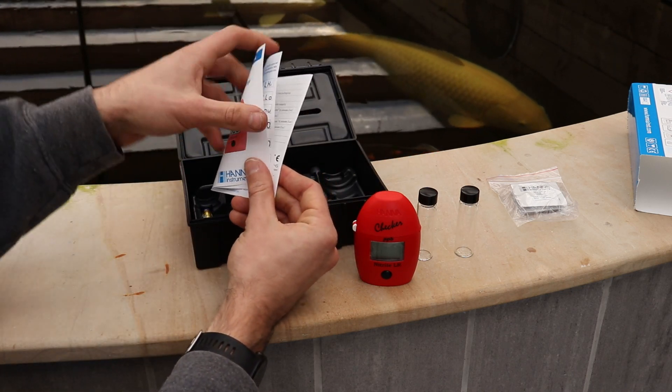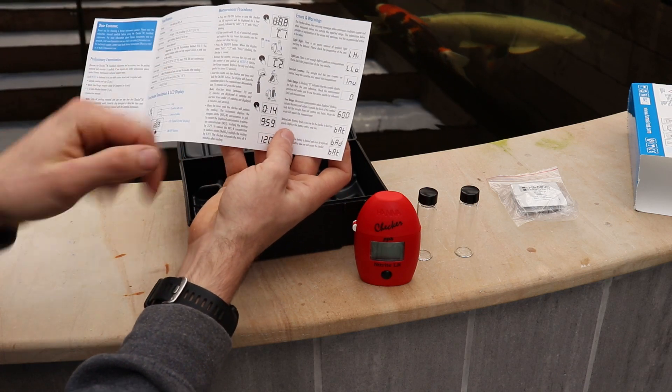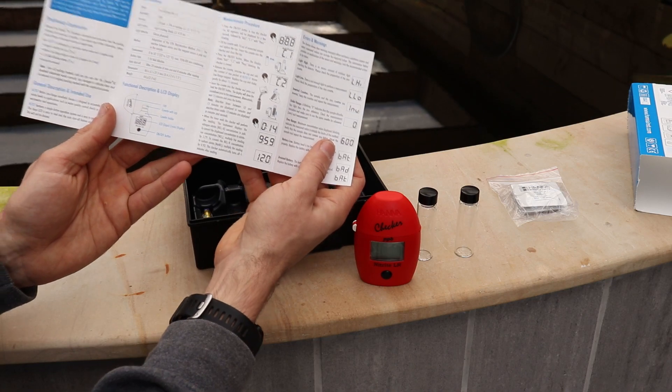At the top you've got your manual — how to take a reading. If you follow this step by step it's going to tell you absolutely everything I do in this video, however this can get a little bit confusing, hence why we're here today.